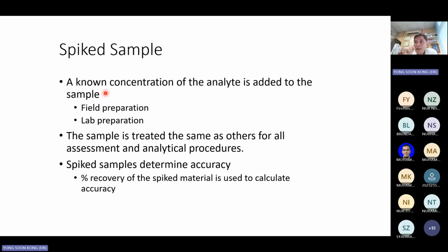Contoh, kalau dalam sampel air korang dah tahu dia tak ada apa-apa kan, so nak detect apa, memang dia kosong pun, there's no contaminants. What if you want to detect a certain level of maybe heavy metal? Contoh, inside your field sample that you have collected, you cuba letak sebilangan kecil heavy metal, contohnya copper. Letak copper. Okay.